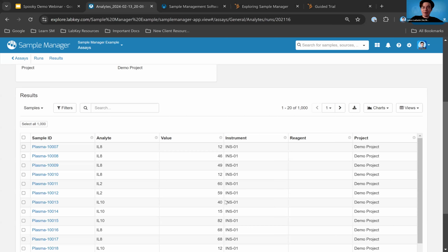Would working with samples in a multi-well plate be pretty much the same as working with a freezer box of sample and workflow handling for your blood samples? Yes, it definitely is. So our boxes, our bags, our well plates, those are what we call terminal storage units. So it translates very nicely. You can name those whatever it is that you need and customize it from there.